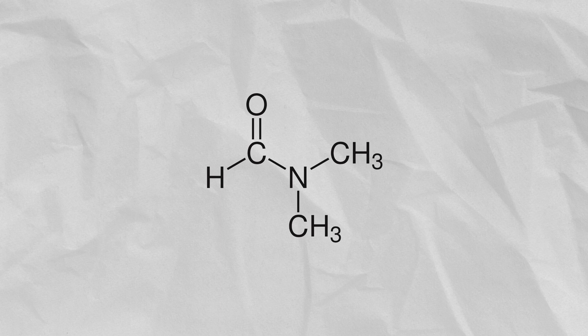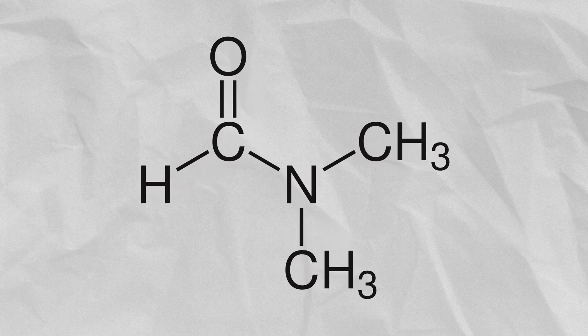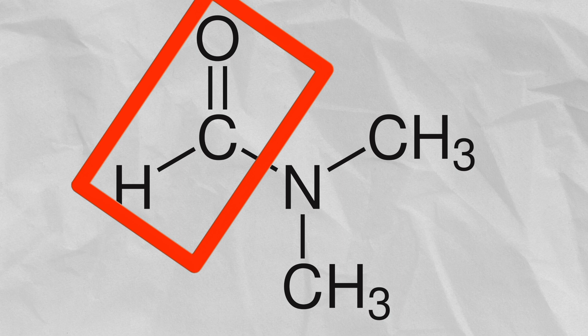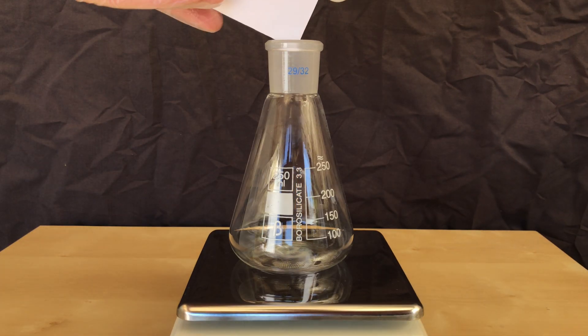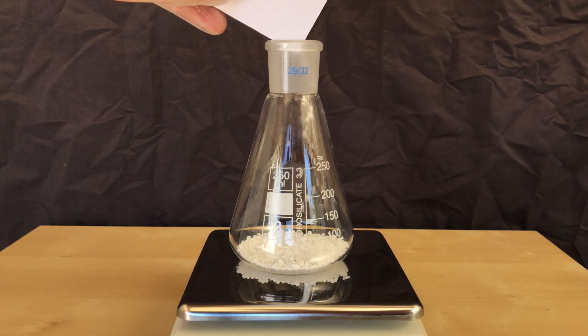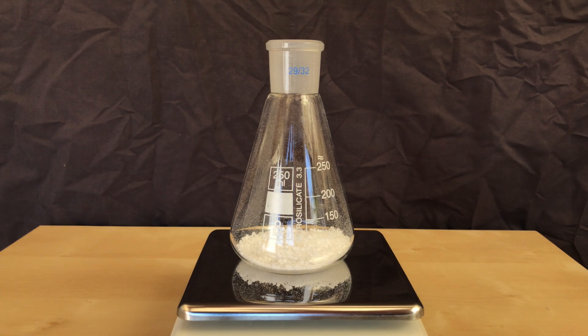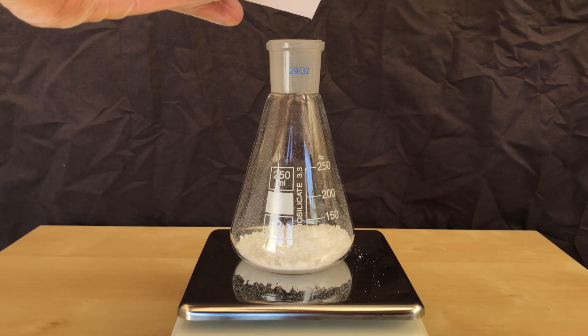DMF is also known as dimethylformamide. Using some chemical magic, it's possible to split it into formate and dimethylamine. I put on some gloves and now I'm ready to begin. A little more than 40 grams of sodium hydroxide, 45 grams to be precise, were weighed out.